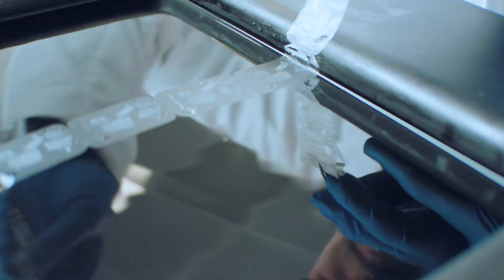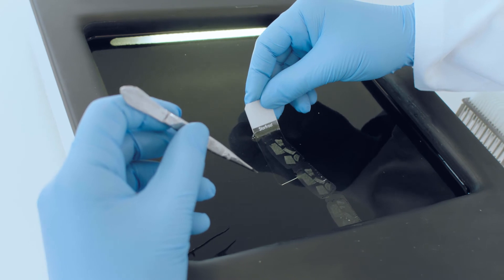Thanks to the easy operation of the AutoSection, every technician in our laboratory is quickly up and running.